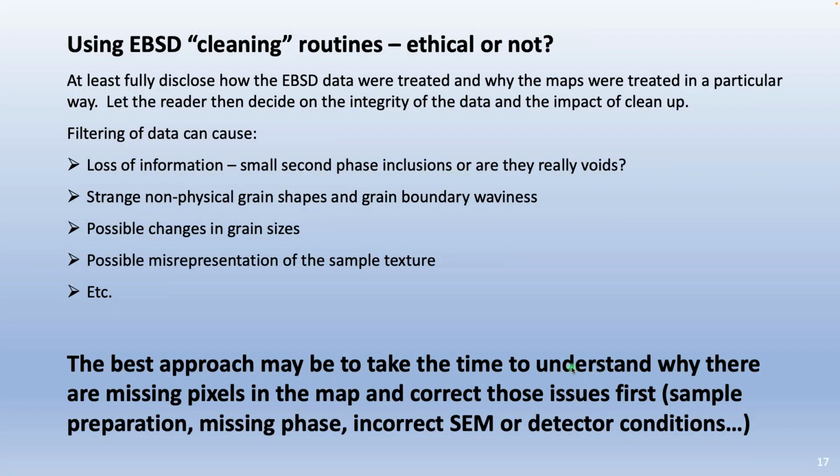So to wrap that part up, using EBSD cleaning routines, ethical or not, I think the most important thing you can do is at least fully disclose how the EBSD data were treated and why the maps were treated in a particular way. Then the reader can decide on the integrity of the data and the impact of the cleanup.